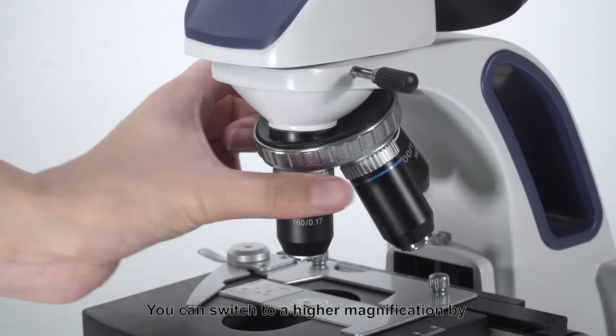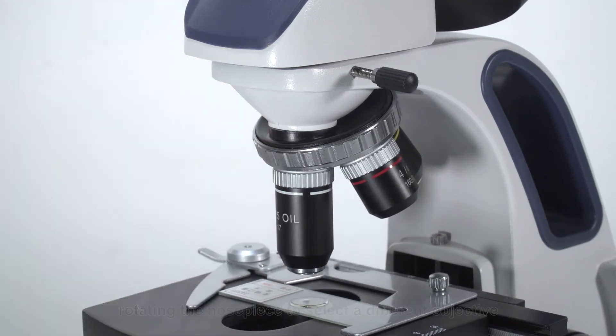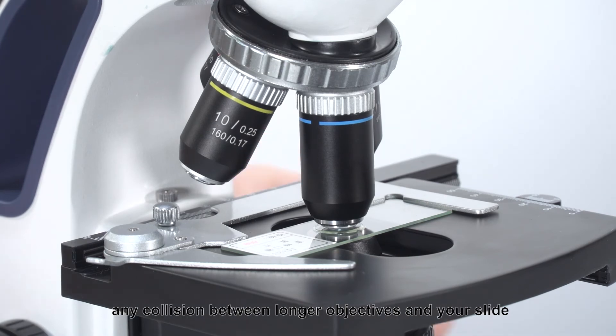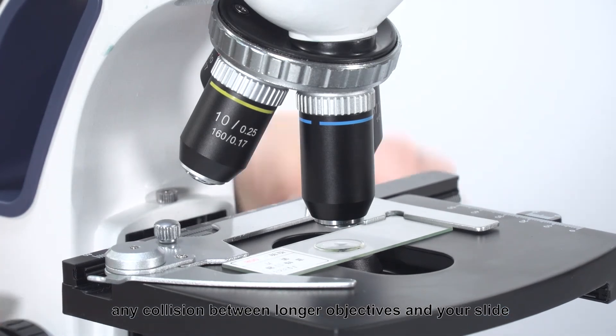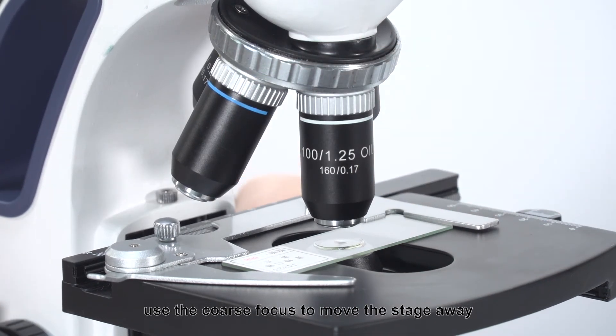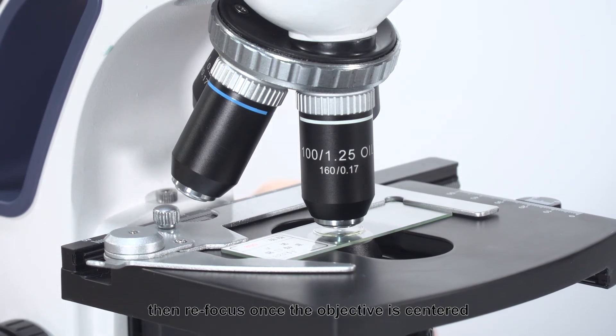You can switch to a higher magnification by rotating the nose piece to select a different objective. The safety rack stop on the microscope should prevent any collision between longer objectives and your slide. But if you can't shift the objective into place without touching the slide, use the coarse focus to move the stage away, then refocus once the objective is centered.